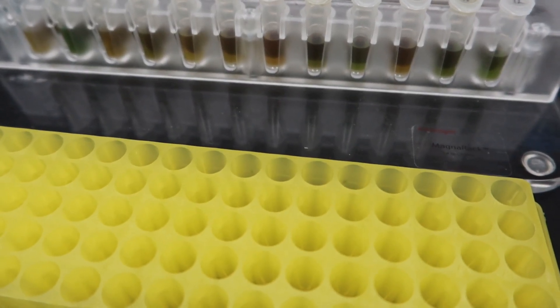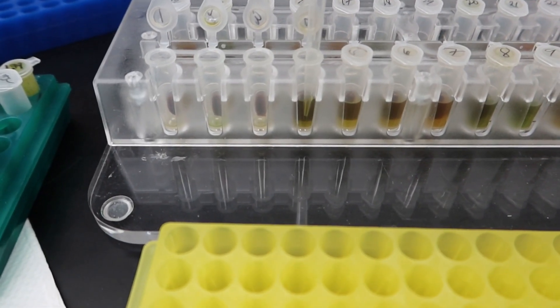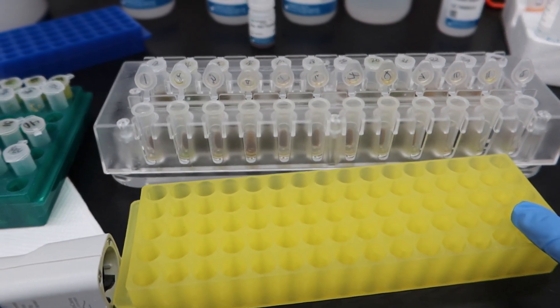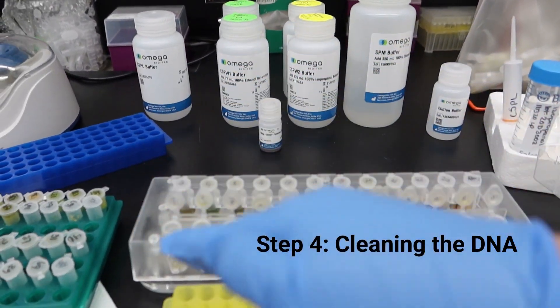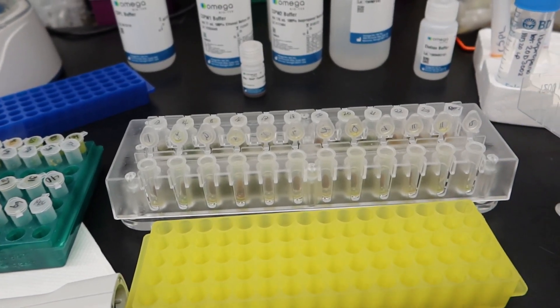I-aspirate natin and discard yung supernatant. After nun, pag-discard, maglagay ulit tayo ng buffer. Step 4: cleaning the DNA. Maraming buffers ang nilalagay to clean the DNA.